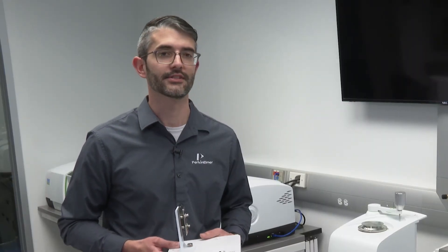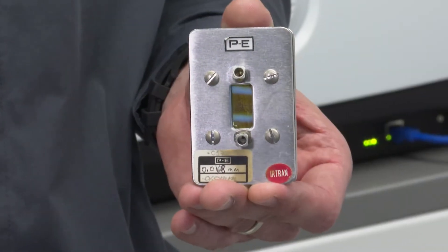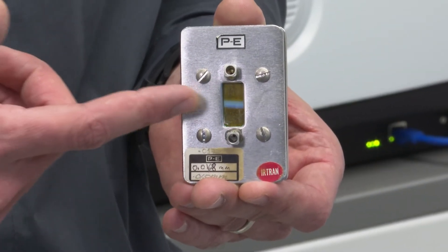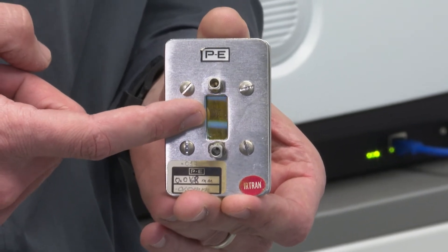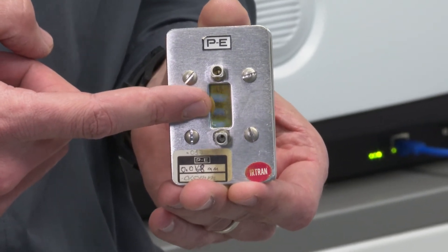When working with solids, liquids, or gases, typically transmission measurements are performed. As an example, with a liquid cell, the window material can be selected to allow measurement in the preferred spectral range for that material type.